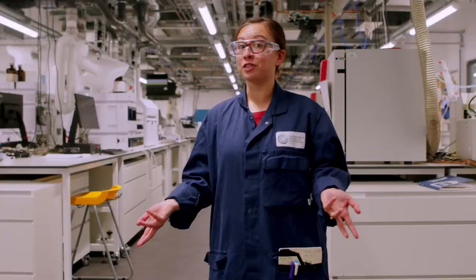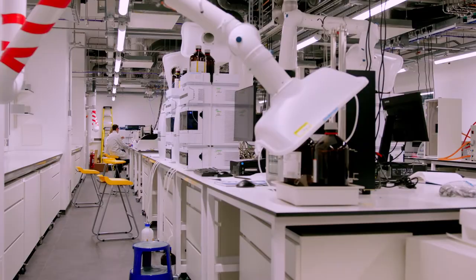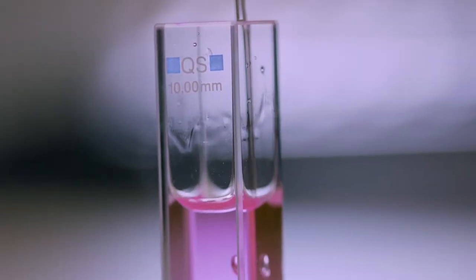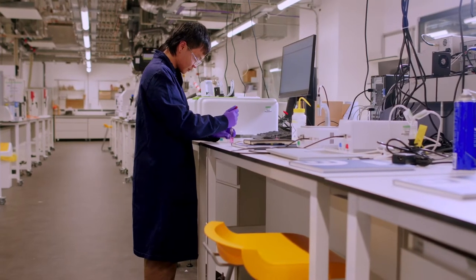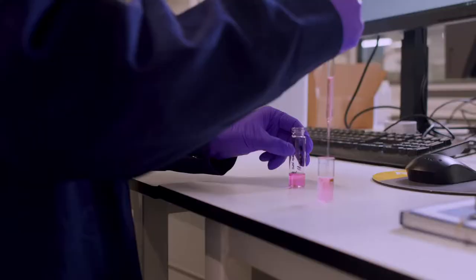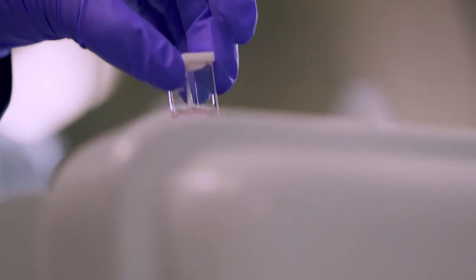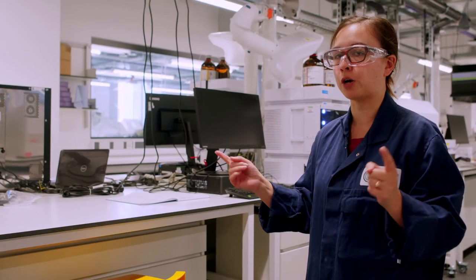So welcome to our instrument lab. In here we have lots of equipment that enable us to characterize different plastics or polymers. On this side we have our gel permeation chromatography suite. What this essentially does is gives us information on our polymer chain length.